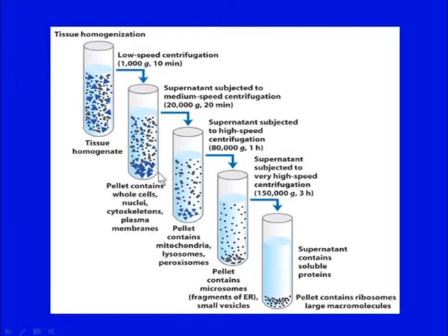Now, again like I said, this pellet is not completely pure or does not constitute only the largest ones, there will be smaller ones also. So, resuspending and recentrifugation a couple of times is required. Now, what is done? The pellet and supernatant are separated, and this supernatant is taken in a fresh tube and then again centrifugation is performed.